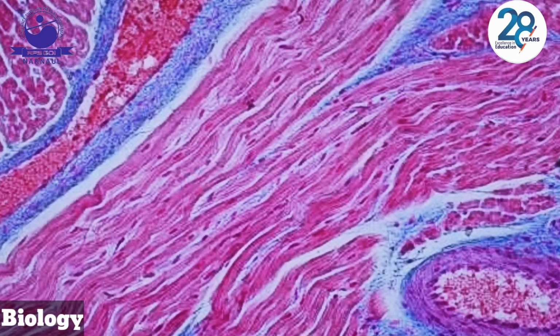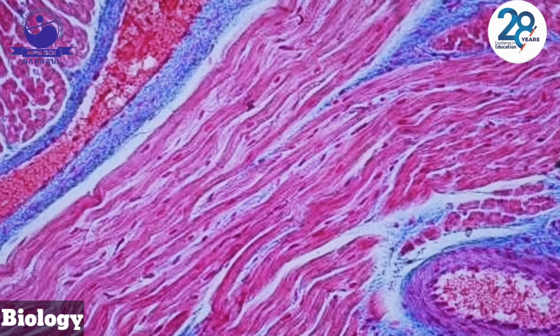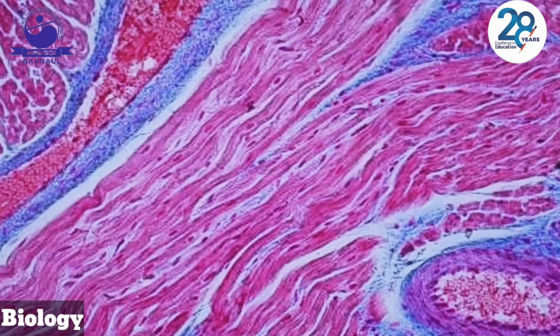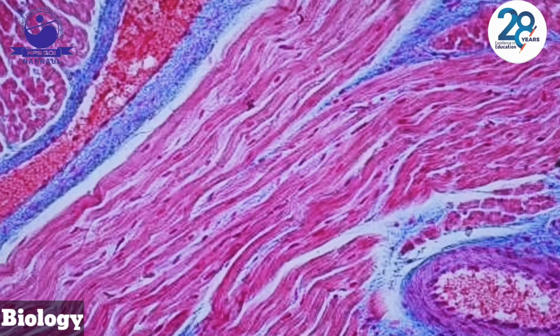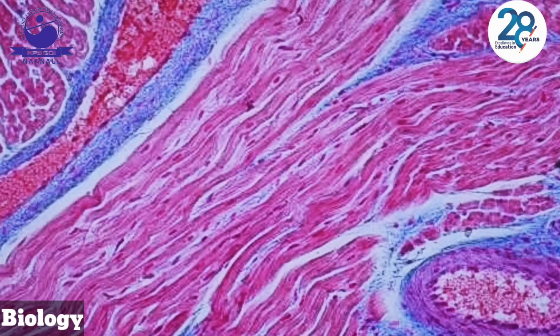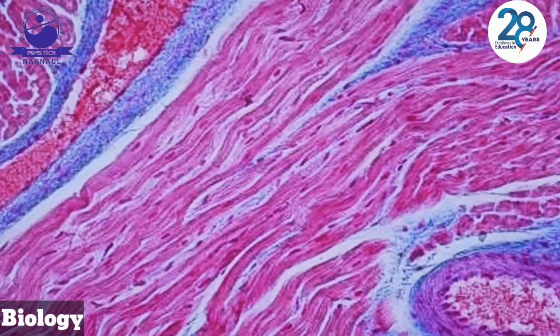Observe it clearly. These are involuntary muscles. They contract rapidly but never undergo fatigue. They work continuously 24 by 7, 365 days. These are the three types of muscles in animals.